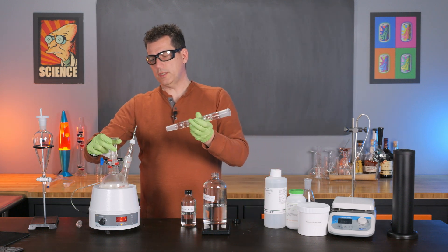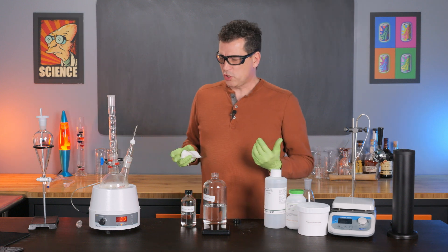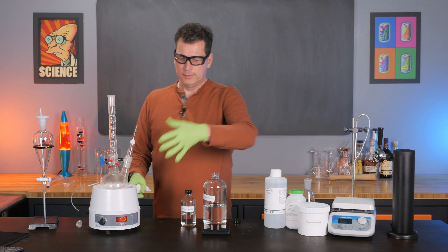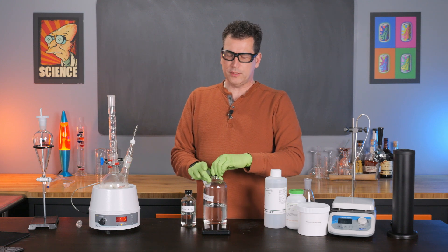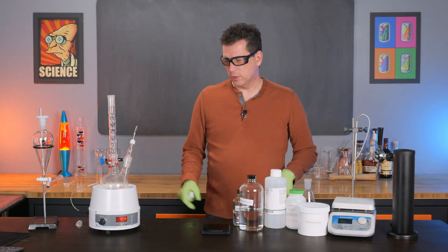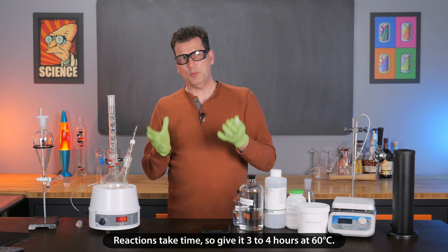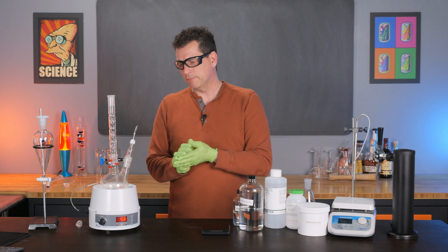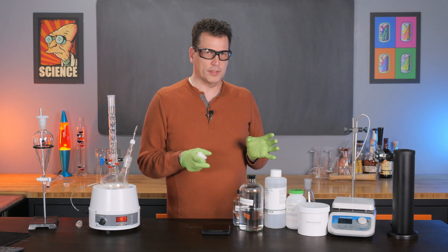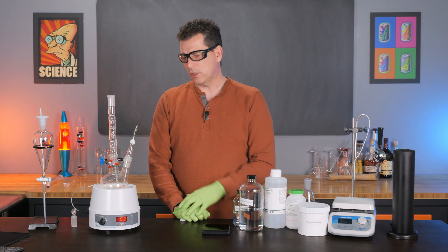Now I'm going to take off the funnel and put on the reflux condenser, then we'll start to increase the temperature to get this reaction going. This thermocouple is tied into a controller — if we set it at 55 degrees Celsius we should be good. I do notice the temperature went up, so there's either some heating from the mantle or the reaction temperature increased. We're just going to let this run for a couple of hours — I'd recommend three to four hours. Don't go too far away from it; I'll check back regularly and then we'll start the purification process.